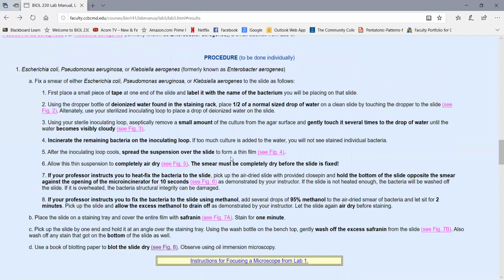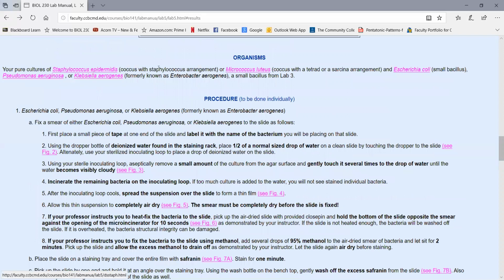And of course, remember, make use of the lab book. The lab book is telling you what each one of these looks like, and you have pictures of them to look at before lab. So you just need to find an area that looks like that. Now, eventually, of course, you'll have to be able to tell me shapes, arrangements, and forms without knowing what it's supposed to be. You'll need to be able to recognize those.